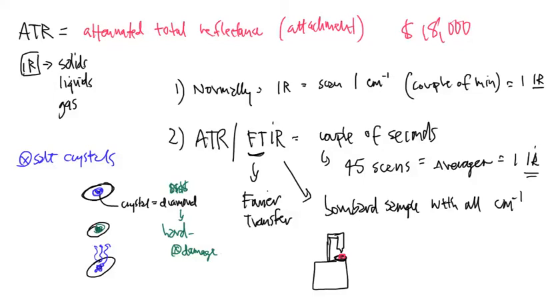That cap is traditionally a piece of plastic that does not degrade in the presence of an organic compound. So the cap puts a hood over the actual ATR attachment and it prevents all of my sample from evaporating from the face of the plate, because it is open air.